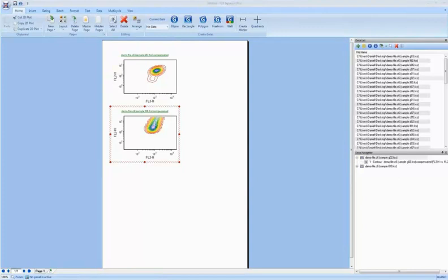So we have a question: when you import, do your stats get imported, or does FCS Express generate them? So FCS Express generates the stats. And if you update your gates or markers or anything, everything in FCS Express updates. The stats are not static at all.